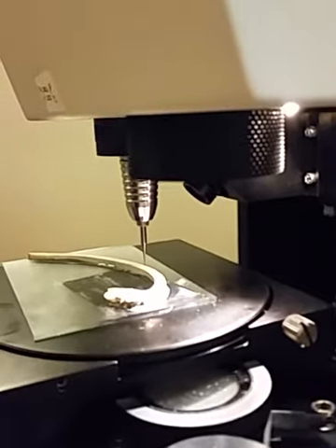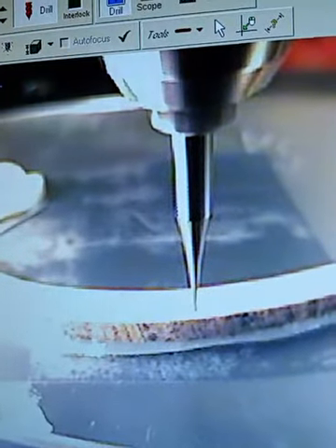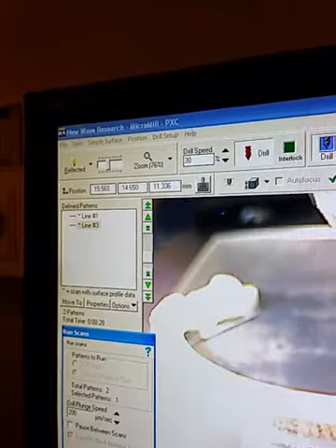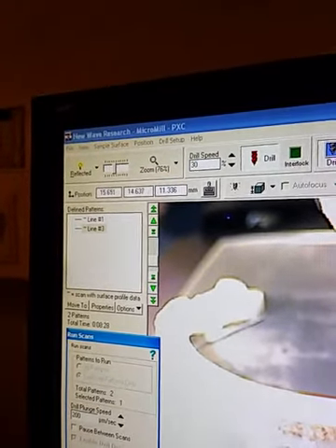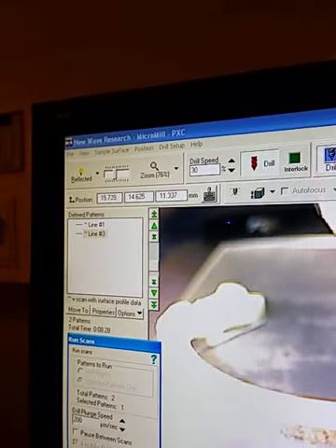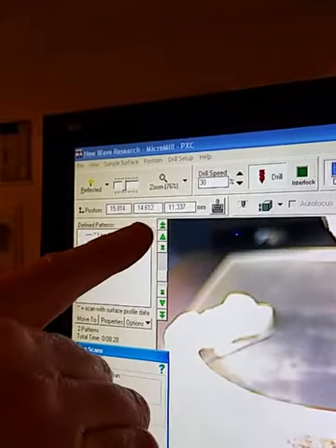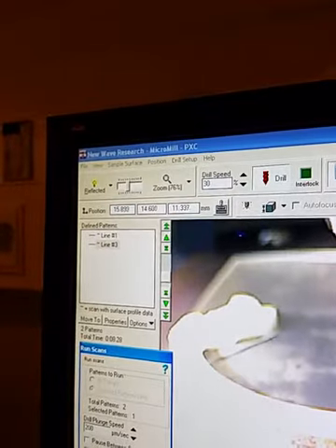So that's a good sound. It's like we got that first push, and then it levels off. Now it's just the X and Y as it translates across the surface. Yeah, we can see we go. No, we don't go deeper. The only time this changes is if, because we use the Z profile, there's a difference between those 2 points, then you'll see this very slowly changing.